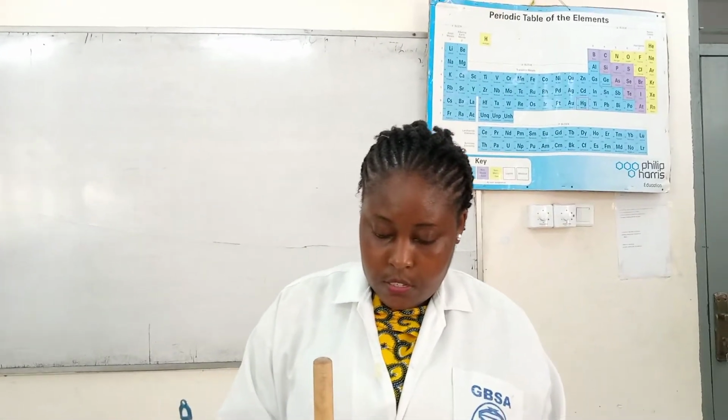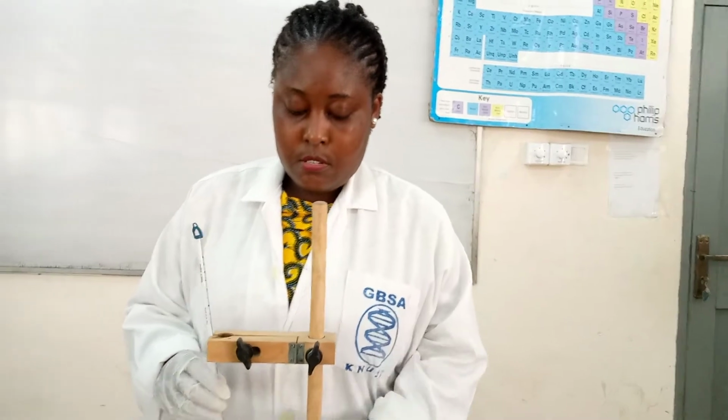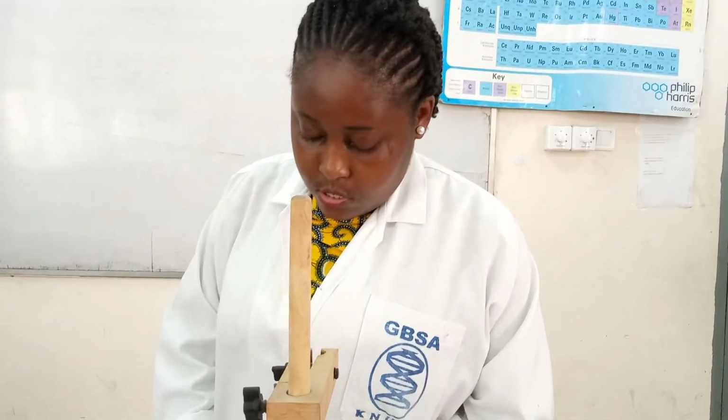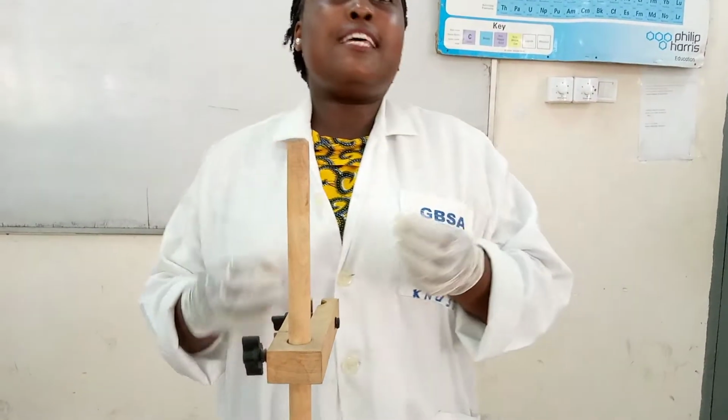Okay. Then I'll quickly bring this out. Then I'll remove the rubber band. Have to be careful because the bulb of the thermometer is hot. Okay, so this is our sample.